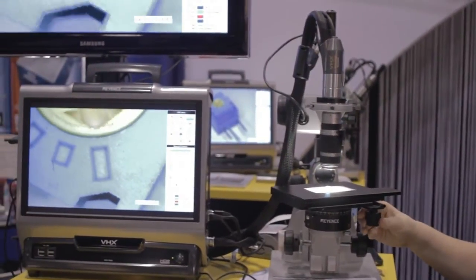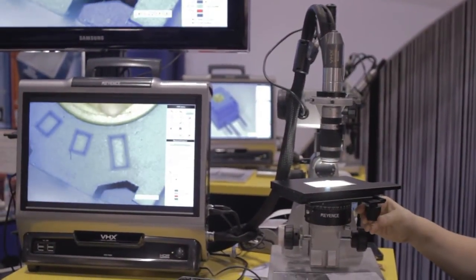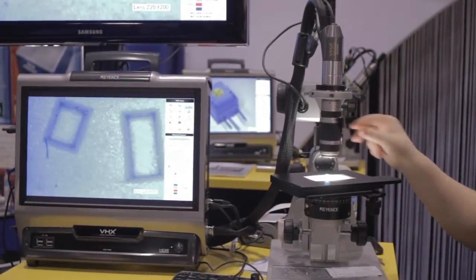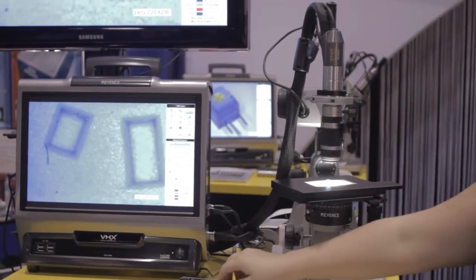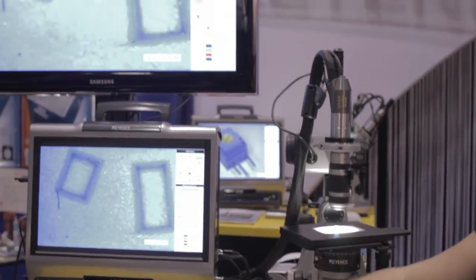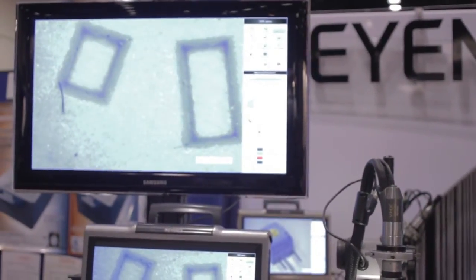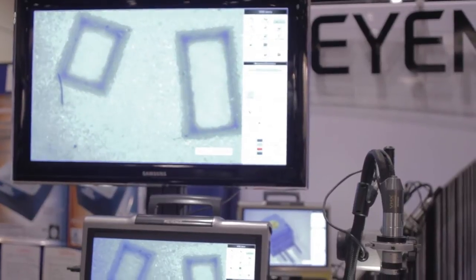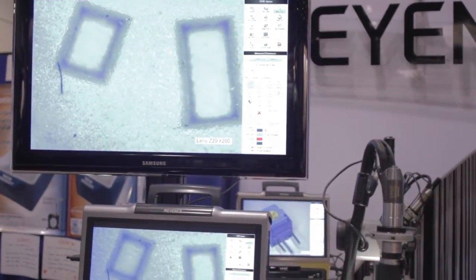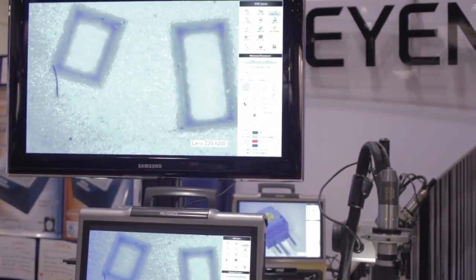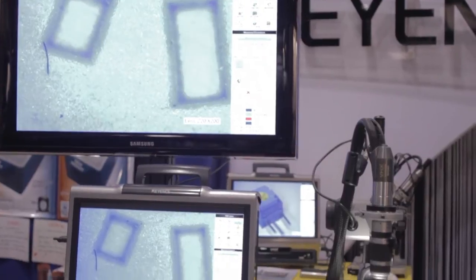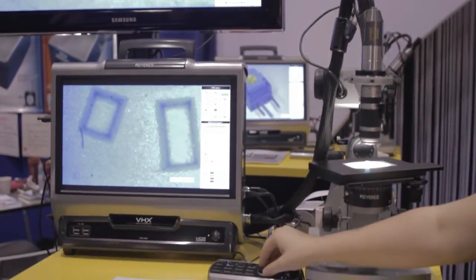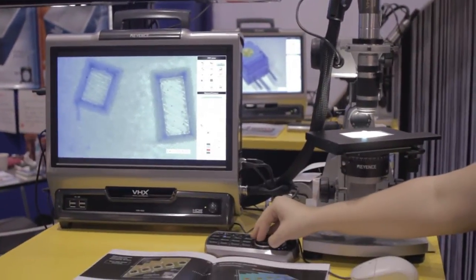But if you are working at higher magnification, one of the first things to go is usually your depth of field. So you'll notice here I just went from about 20 times magnification to 200. So now I'm able to get the top of those pits in focus, unfortunately not the bottom. Or I can get the opposite image.